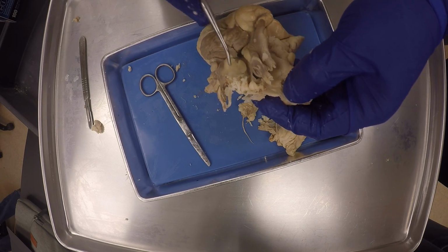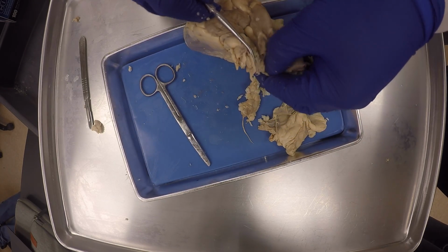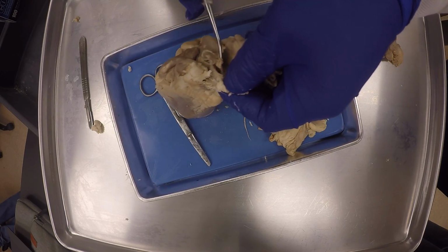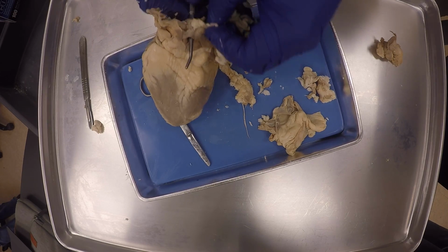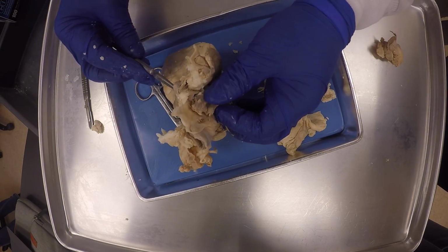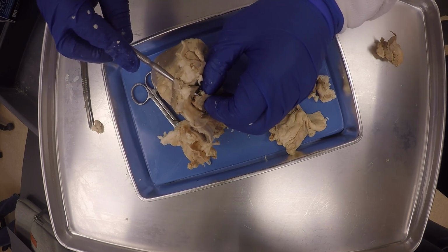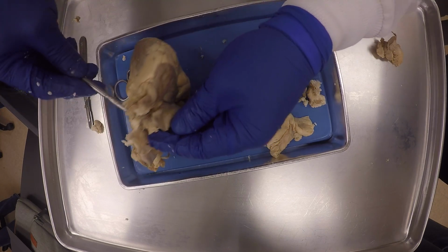You see, this one was attached to this. This was a branch of this one right here that I tore off. It was coming in like that, and then going in here like that. This is the left and right pulmonary arteries.